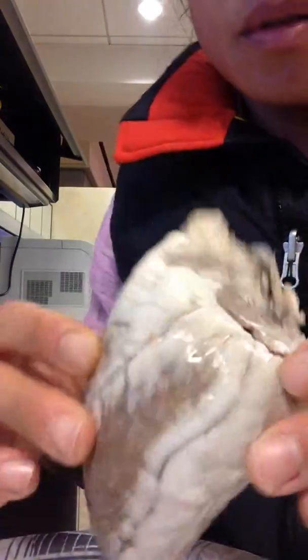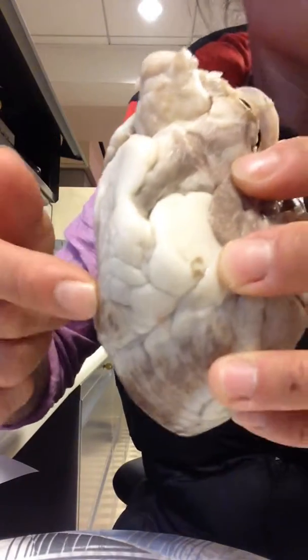Okay, so this is the sheep heart video for the lab. Number one, the pericardium. Sorry, let me just close this up. Okay, so that's the full heart. So the pericardium is right here, right there.